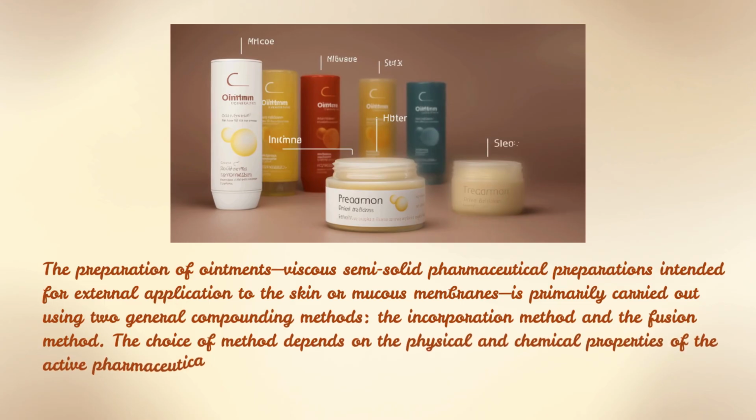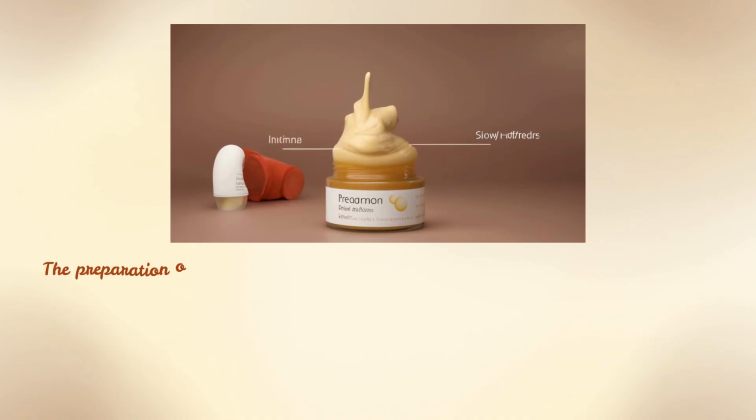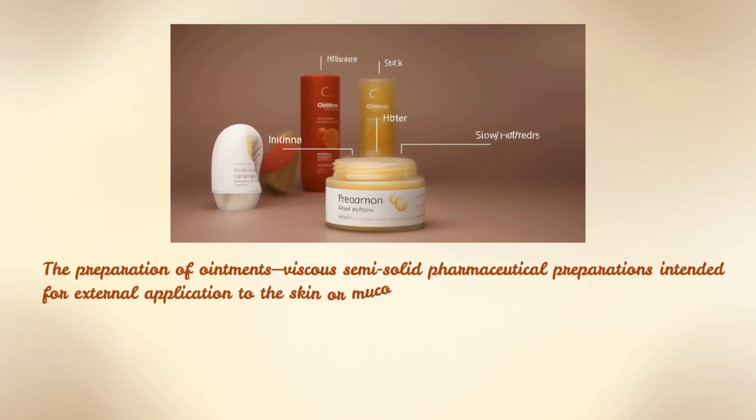The first step is melting the ingredients in the correct order. Components are melted in a water bath starting with those having the highest melting point and then gradually adding ingredients with lower melting points. This approach prevents overheating and protects the ingredients from degradation.